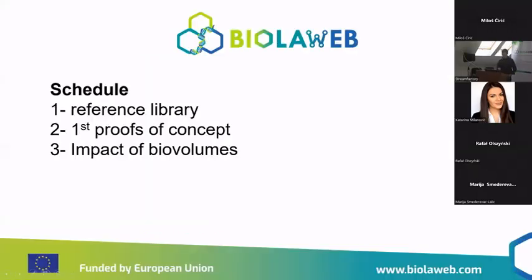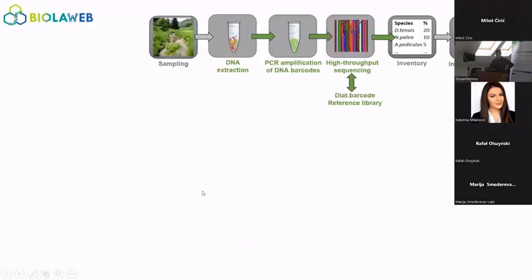So here is the schedule I propose for this first part. First, we'll talk about the reference library that we set up. Then the second part will be the first proofs of concept and the impact of biovolumes. So let's first talk about reference libraries.